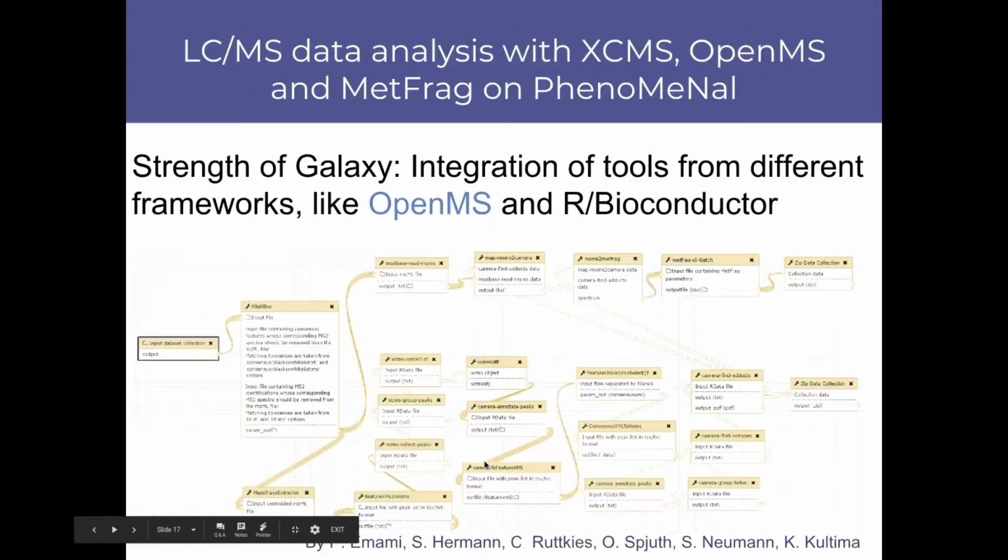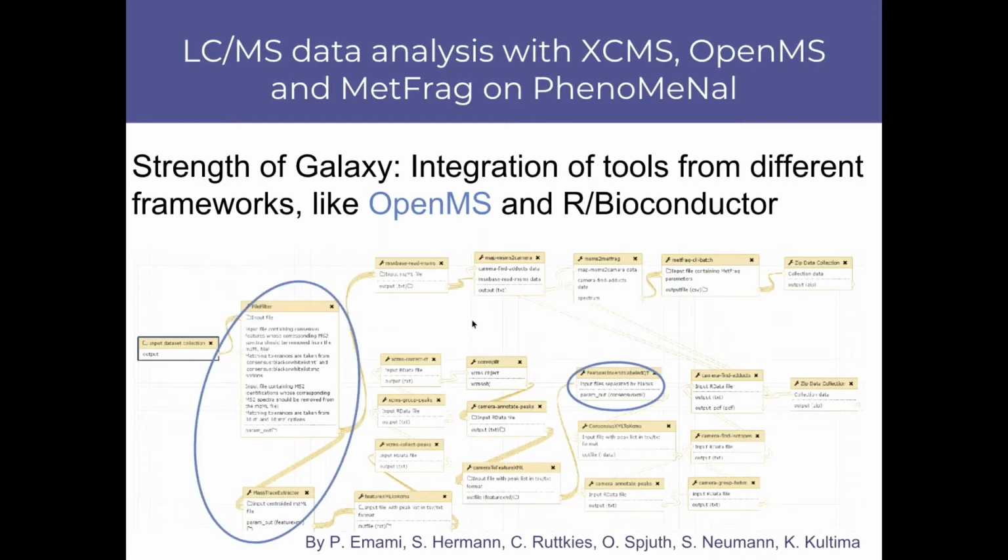And Payam and Christoph have created this really large workflow where I'm not running through the individual steps. I'm really only highlighting that right here at the beginning, there are some OpenMS tools that are being run. Then there are some XCMS tools being run. And then you can also convert that back to the OpenMS world. That is a pretty cool feature because it allows you to bring together the tools that otherwise would require a lot of effort to get together.